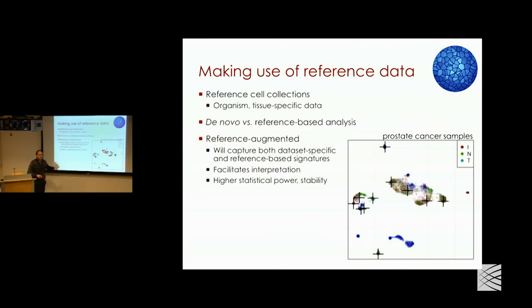So there are 2 parts to this. Actually, one is easier than the other. First of all, I keep saying that they're aspects of variation. Essentially, they're robustified versions of the principal components we pick up that actually distinguish the clusters. We try to trim them so they are more robust in being moved over to a different data set.